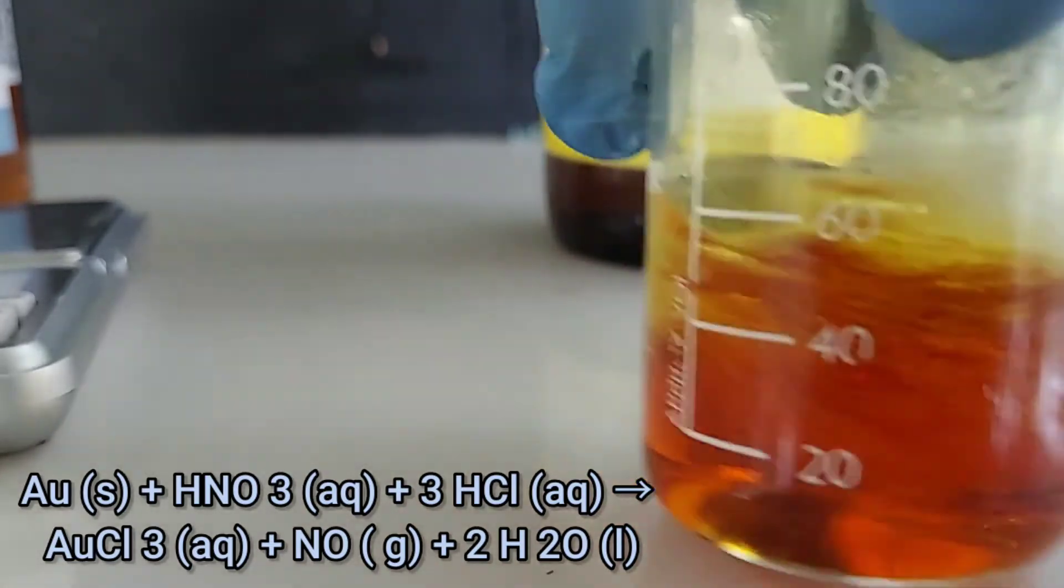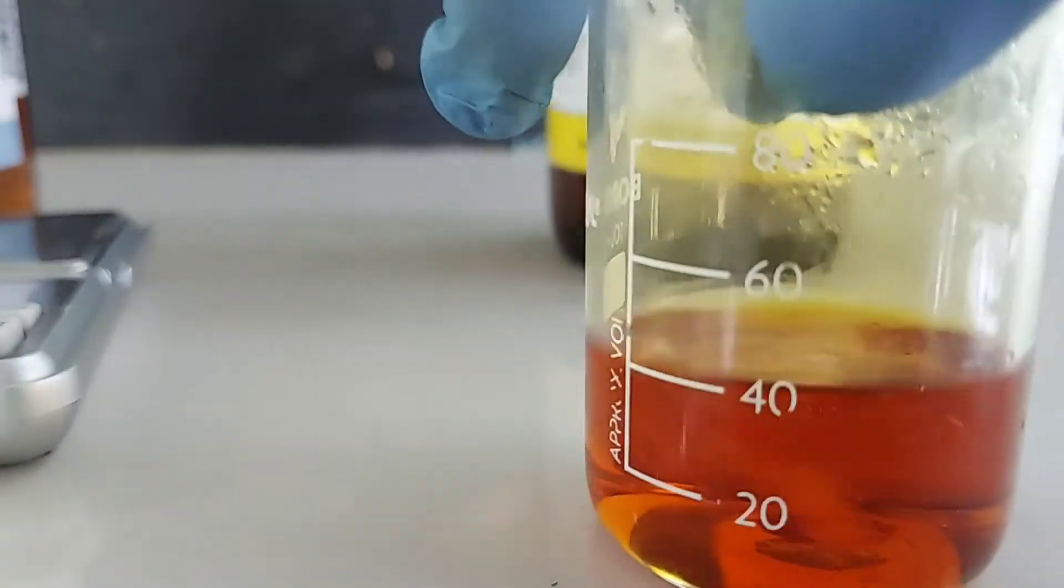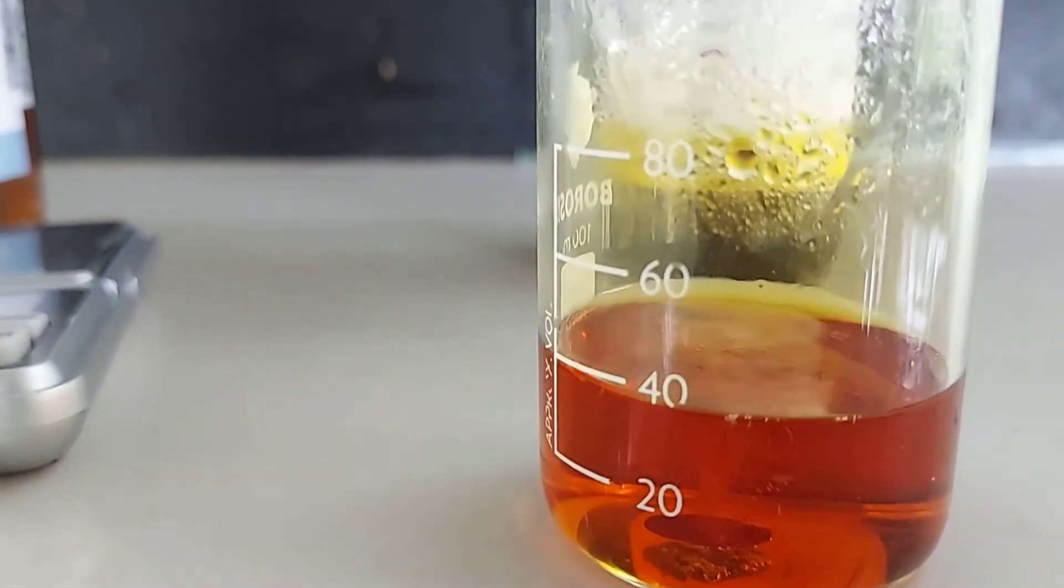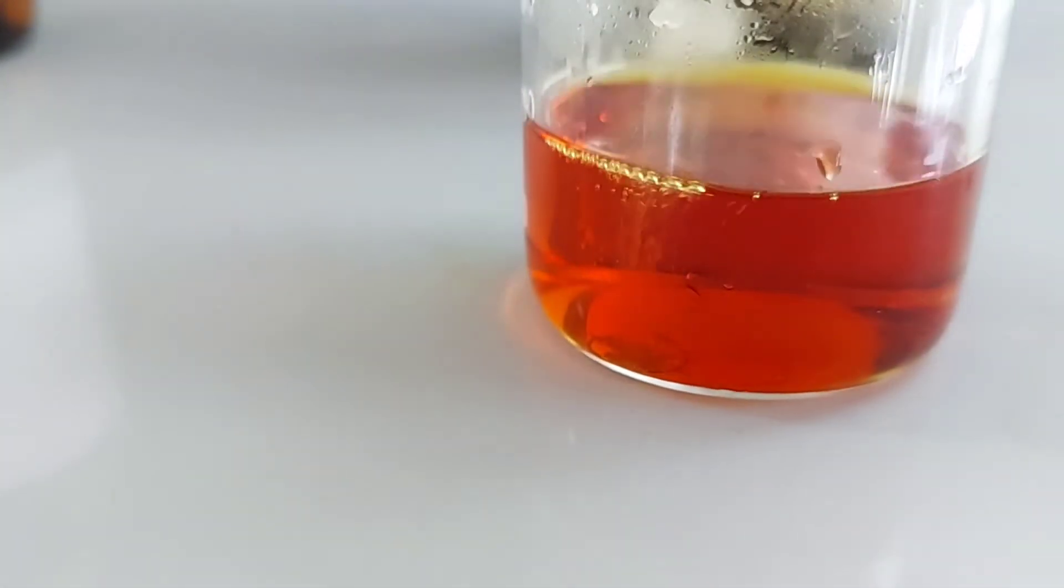But when hydrochloric acid is added into the solution, it will provide chloride ions, Cl- ions. This chloride ion will react with Au3+ and form chloroaurate. And this chloroaurate will dissolve in the solution as chloroauric acid. So we can dissolve gold by adding hydrochloric acid and nitric acid together.